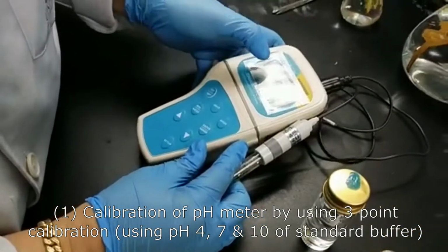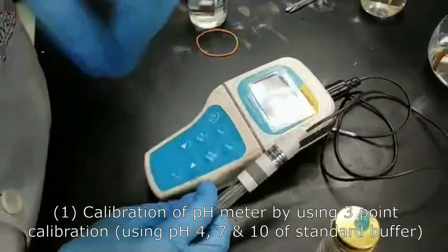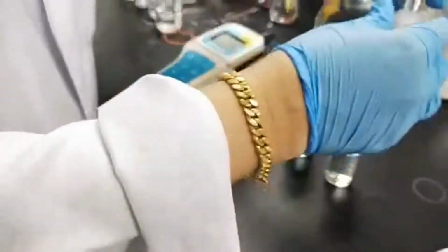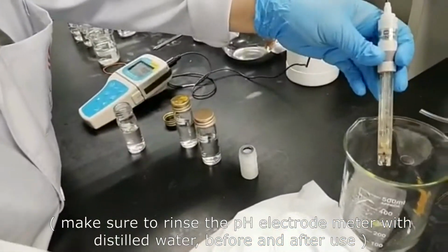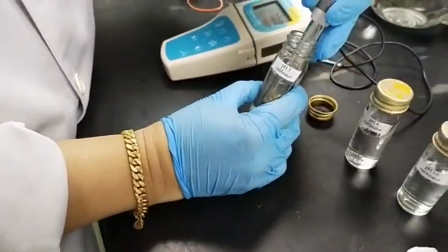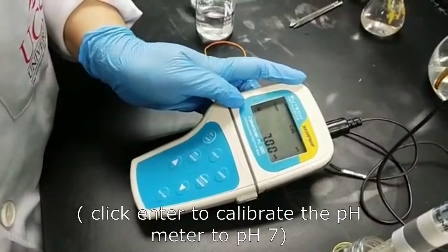So now the calibration asks for pH 7 buffer, standard buffer. So we have here pH 7 calibrator, but before adding it in we will need to wash and also wipe the insert. Okay. And put it inside, and it will automatically... you have to press enter for it to set to 7.